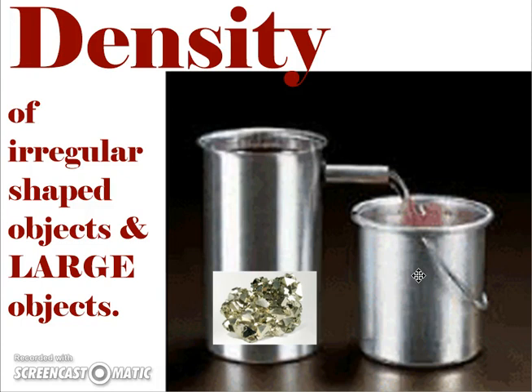This is pretty nice, but water has a strong surface tension, so it isn't always perfect. So it's best if you can use a graduated cylinder directly, but again, if it's just too large, that isn't going to work. Also, with this type of specimen, you need to watch out that it doesn't hold bubbles inside of it and lose more volume that way. So, let's see what's next here.